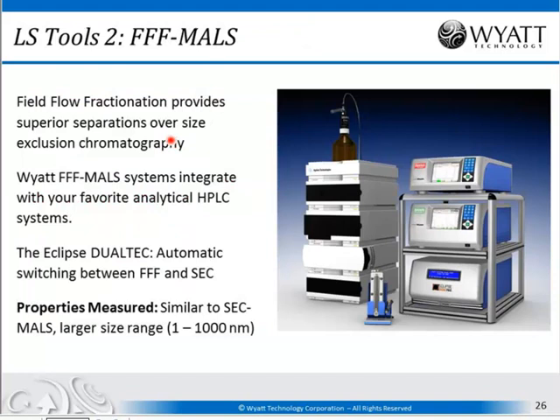The second technique, which I'd like to go through relatively quickly, is FFF-MALS. FFF-MALS is another technique that utilizes fractionation or separation upstream of the light scattering. It's your go-to technique when standard SEC is not appropriate for your molecules. So if your molecules are sticking to the column, or you need to measure over a size range larger than a standard SEC column allows, or it's important to minimize the interactions between the molecules and the packing phase, field flow fractionation allows you to address these with a more sophisticated separation system.